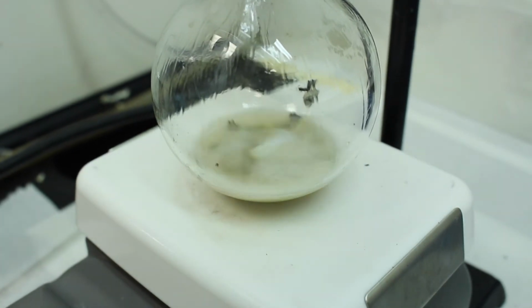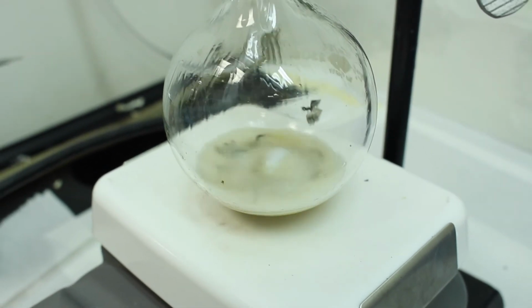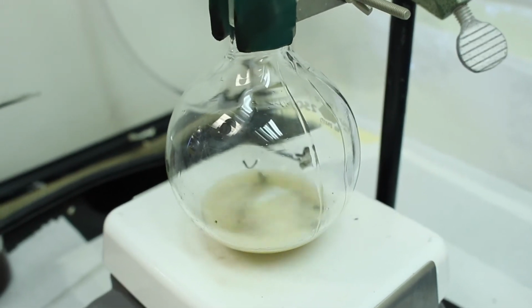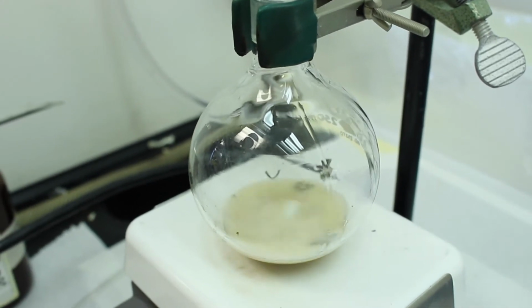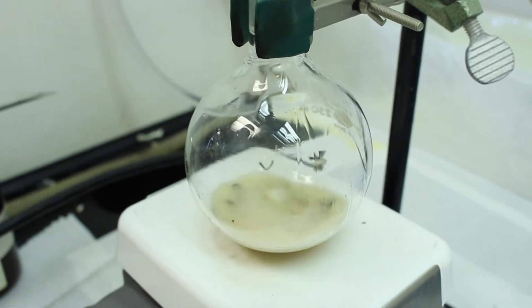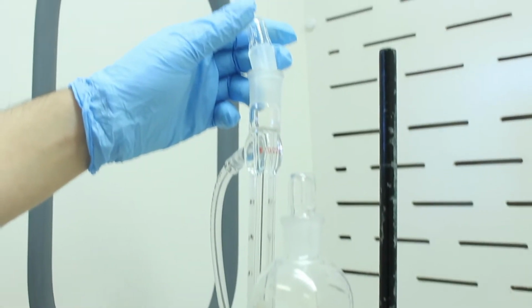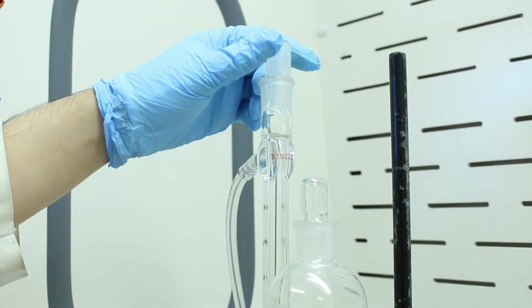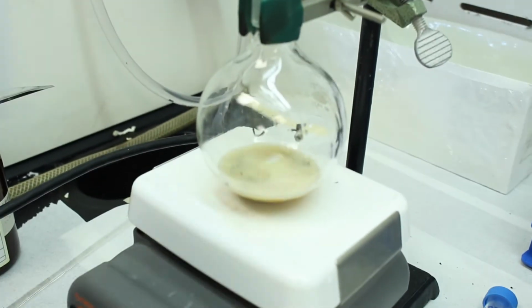Okay, and then now we're just going to drip in the bromobenzene slowly. Oh, see, it's warm enough to push the stopper out here. Okay, and what we'll do is we'll undo this stopper here gently. In fact, you can probably inert it. So this will not form a seal here, so there's no overpressure in the system, but it will prevent too much air from flowing back in.